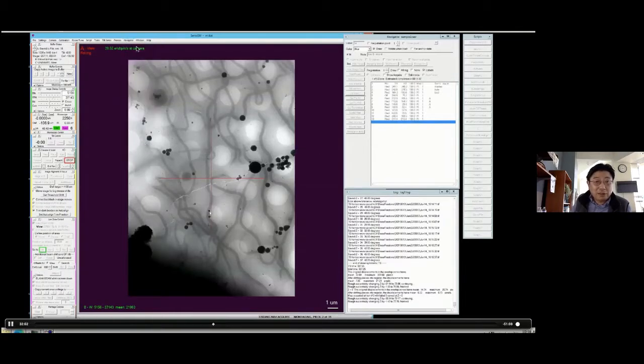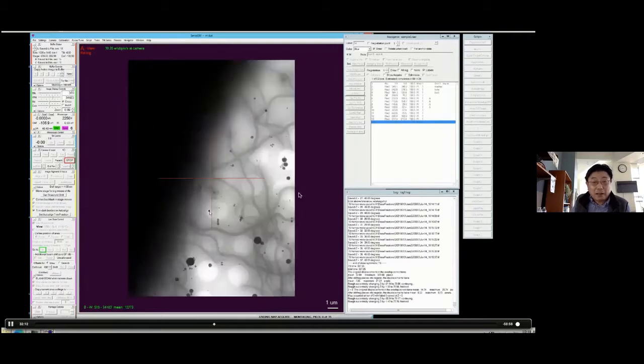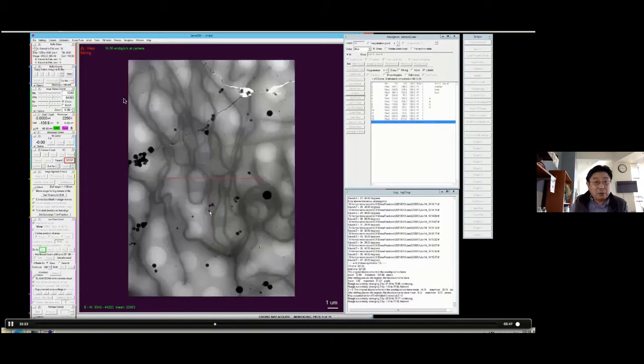And after this one, I said I should stop it. So I put an end cryo. So after they finish this one, this will stop. And because we want to show you the next step, hopefully quickly, the nice thing about this software is it becomes very flexible. So you can go here to acquire, end the cryo.